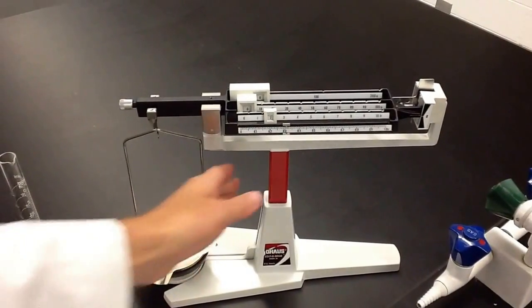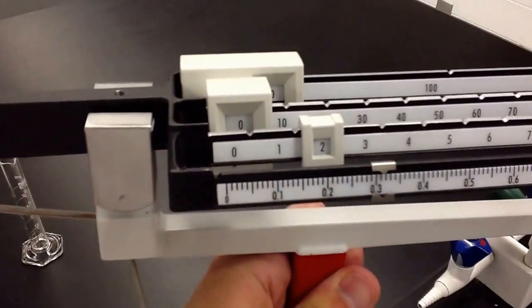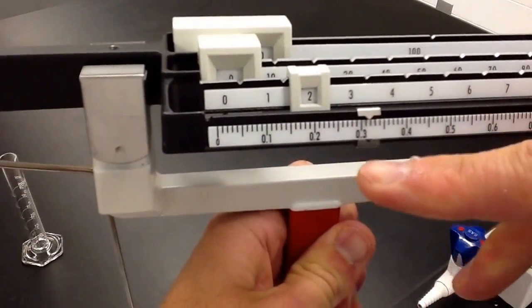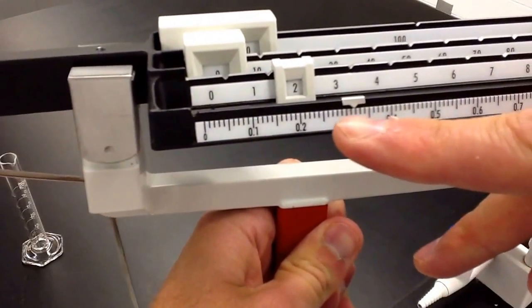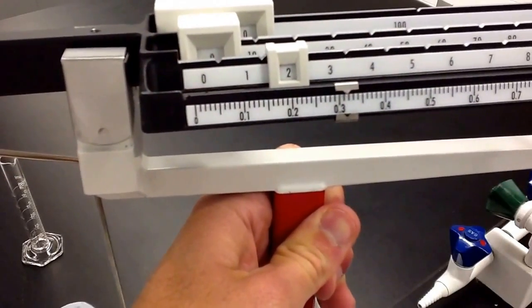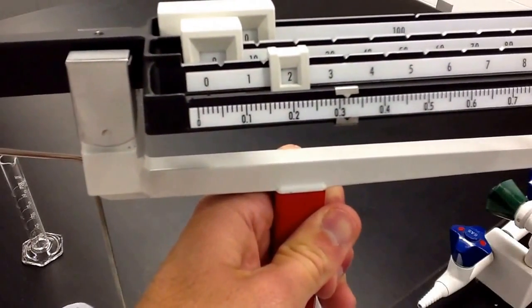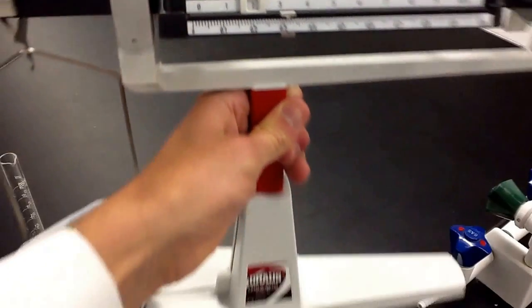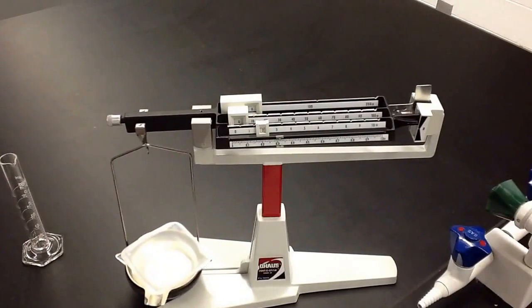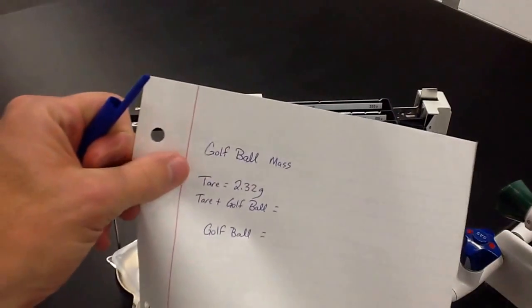Now we're going to read this. So the way we read this: this is two grams right here and this is 0.3, so that's 2.3, and then it is 2.31 — it's between the 2.31 and the 2.32. We really could read this to three places after the decimal but we're only going to do it to two, so I would call this 2.32 grams. Now I can put the golf ball on there and we always go to two places after the decimal. I've written down what the tare mass is: 2.32 grams.